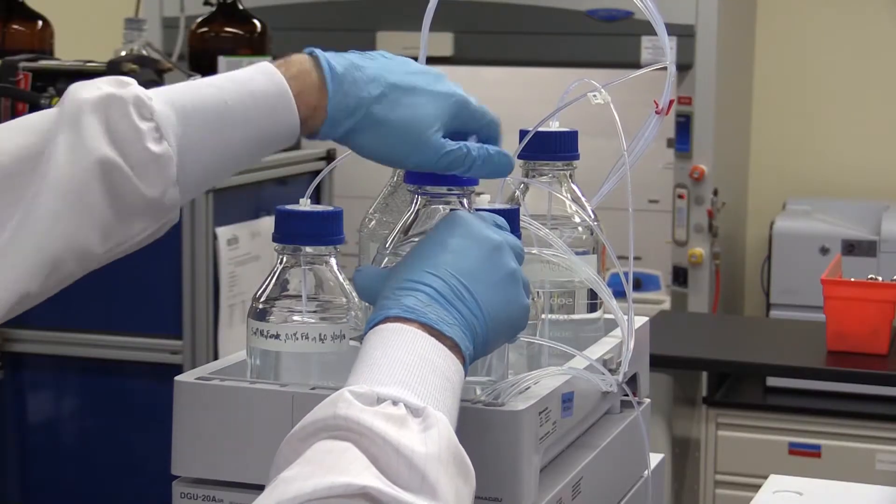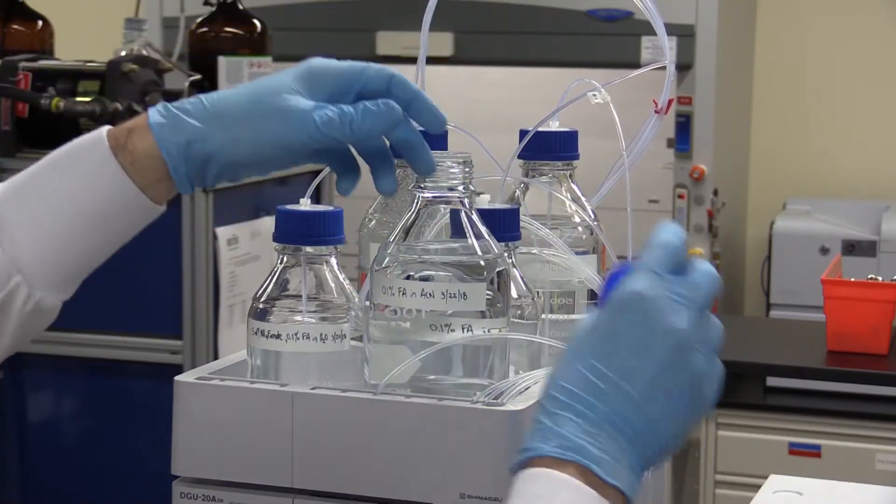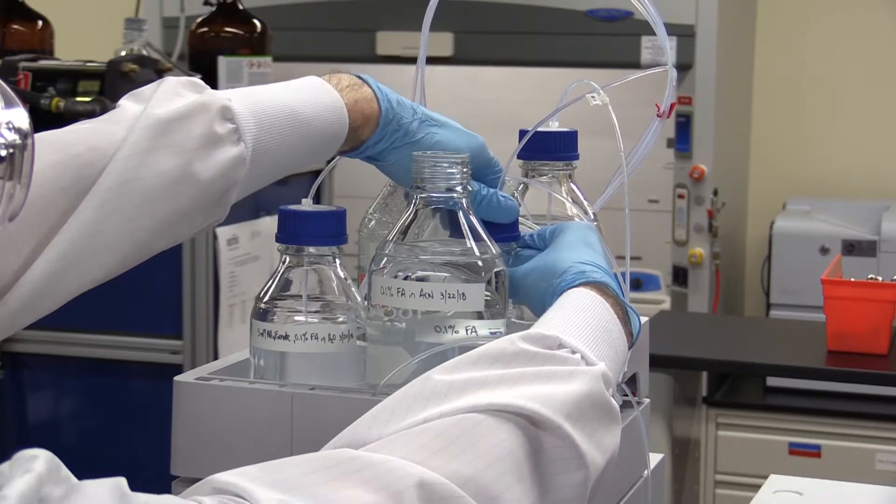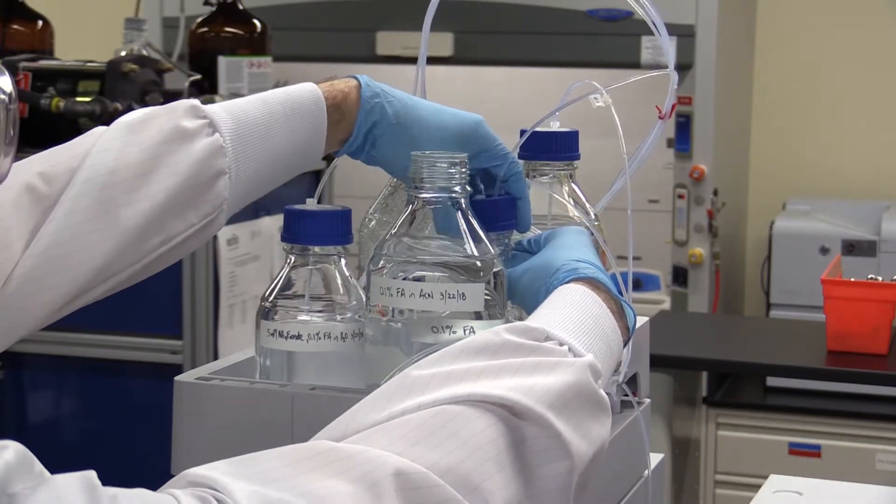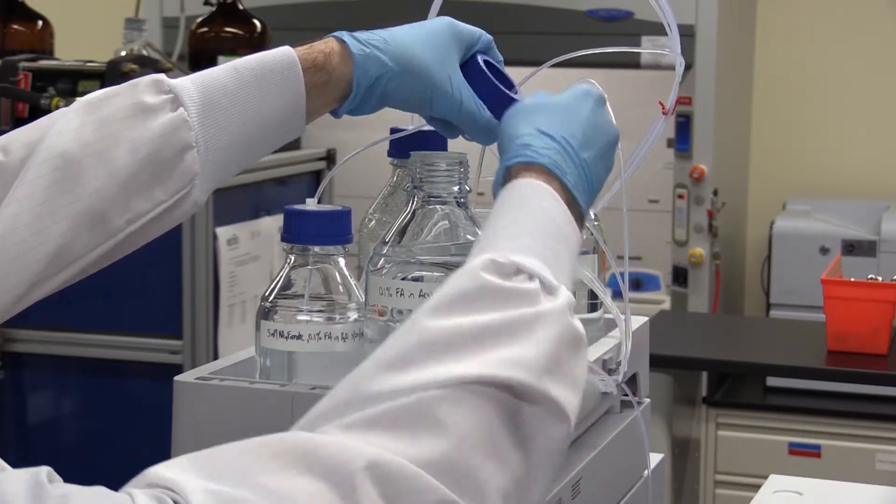So the best way to do this flushing is to prepare a mobile phase that matches the initial conditions of your run but without the additives. Flush this through the column for 10 to 20 column volumes.